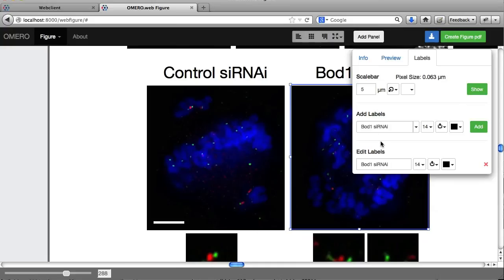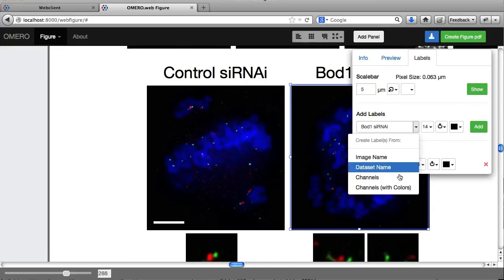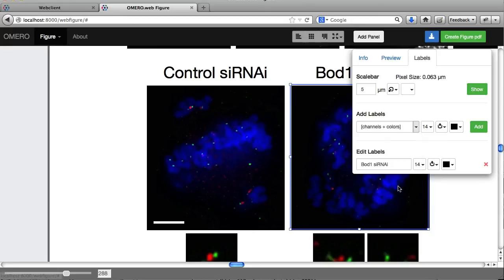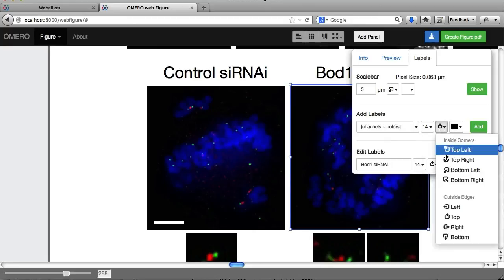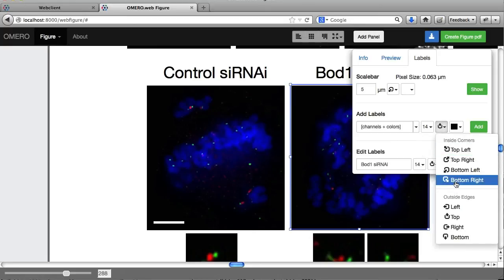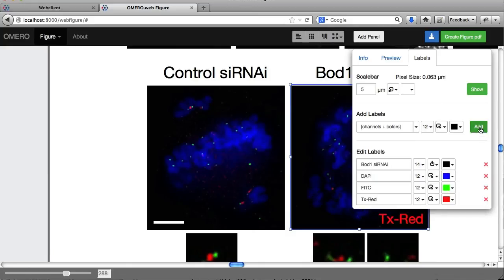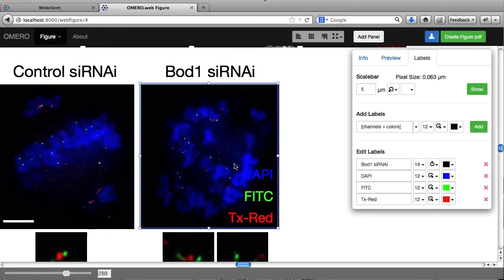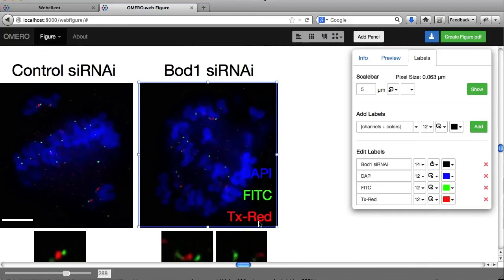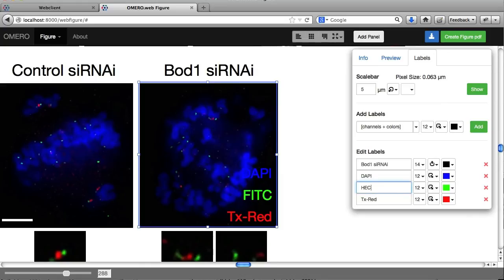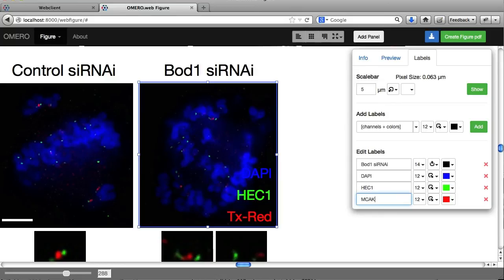And I'm going to add channel labels to this one. Again this is going to be on the bottom. Size 12. You can see they've added DAPI and FITC. In this case these are not quite the right names. I want FITC to be HEC1. And Texas Red is going to be MCAK. Great.